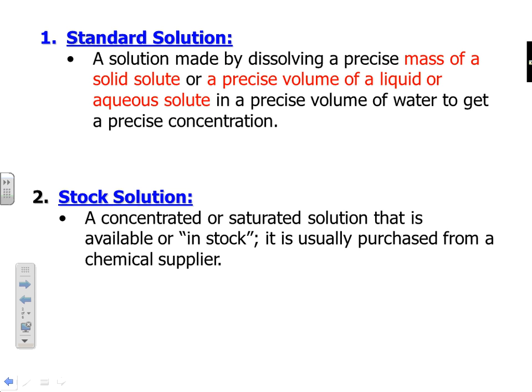Now, a beaker like this, I can get a case of these, 12 of them, probably for 80 bucks. And for a flask like this, it costs about $60 or $70. So when I knocked it over earlier on, I was panicking a little bit because I was just on the verge of breaking my $60 flask, all right? The reason they are so expensive is because they're precise. The manufacturing technique must be such that they know the volume is exactly 250 milliliters. So we will be using volumetric flasks.